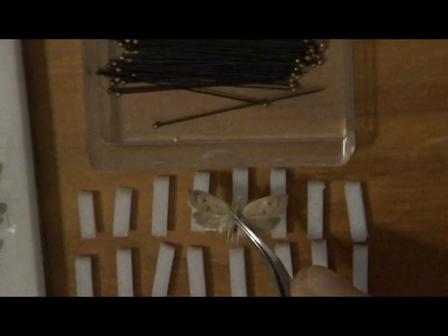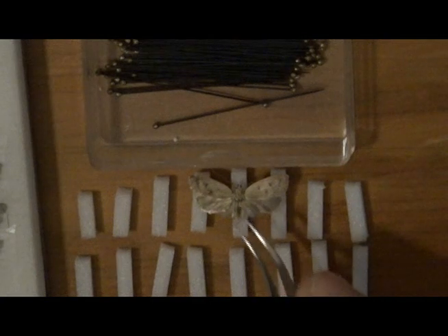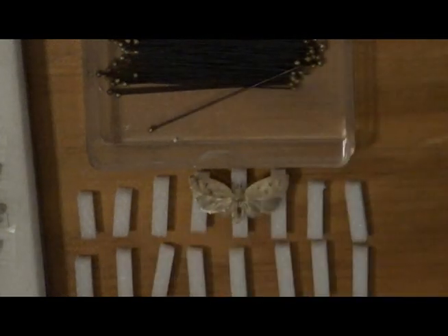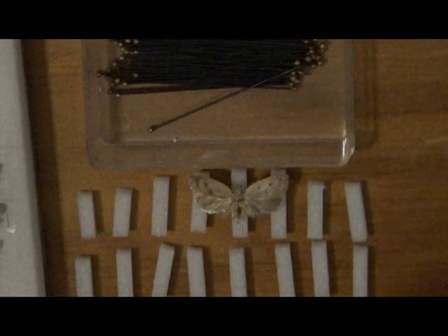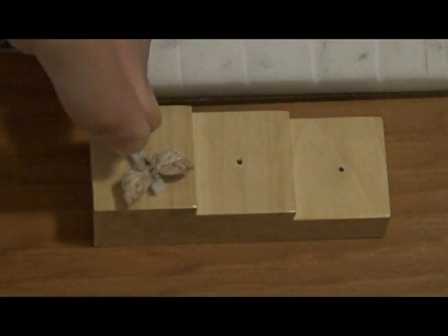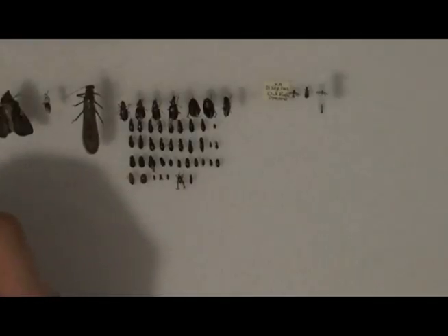I'll move the moths to a short strip of foam I've pre-cut. I then drive a larger pin through the other end of the strip — this is called double mounting. I'll give the moth one more temporary data label before I make a permanent one.